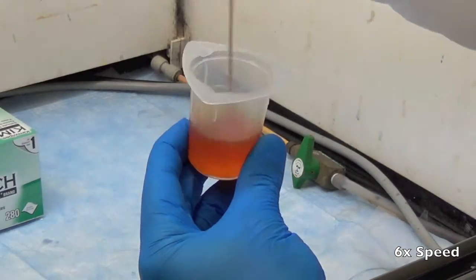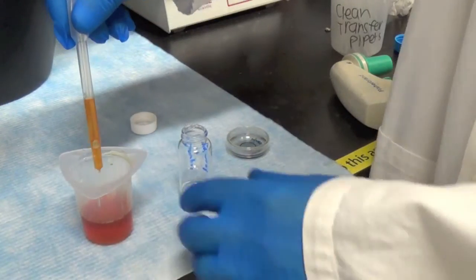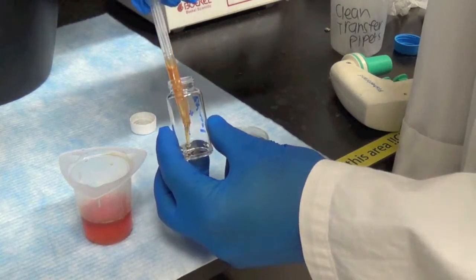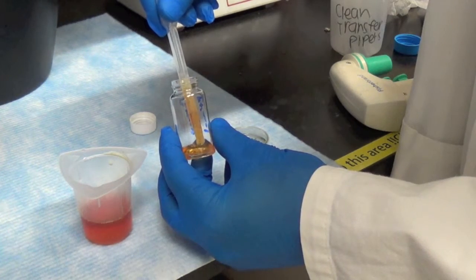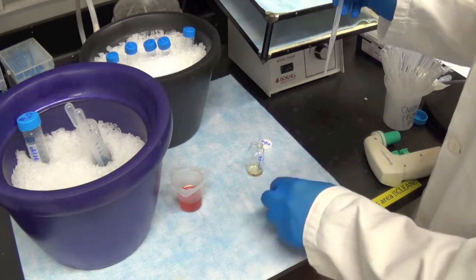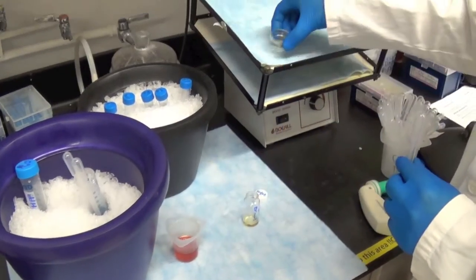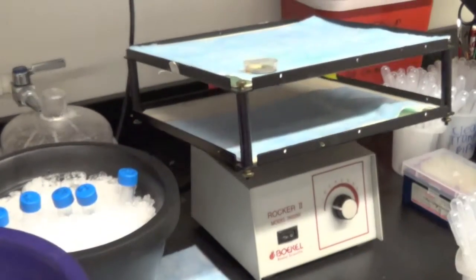Proper mixing is key. As a rule of thumb, we stir 100 times in each direction. Once completed, make a mixture of 50-50 Durcupan to ethanol and mix thoroughly. Remove the 100% ethanol from your sample and then place your 50-50 mixture on top. Incubate on a rocker for 20 to 30 minutes.